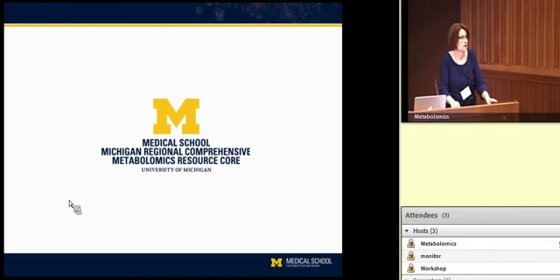Okay, we're actually not using the blank plasma. Our standards go on the instrument neat. Sorry, did I misspeak? We are not using a blank for the calibration curve. We're using neat pure standards in organic solvent. But the internal standard is in that mixture as well. So when it's in your sample, the relative amount of the internal standard in your sample to what's in the calibration curve will allow you to normalize between the calibration curve and the sample.